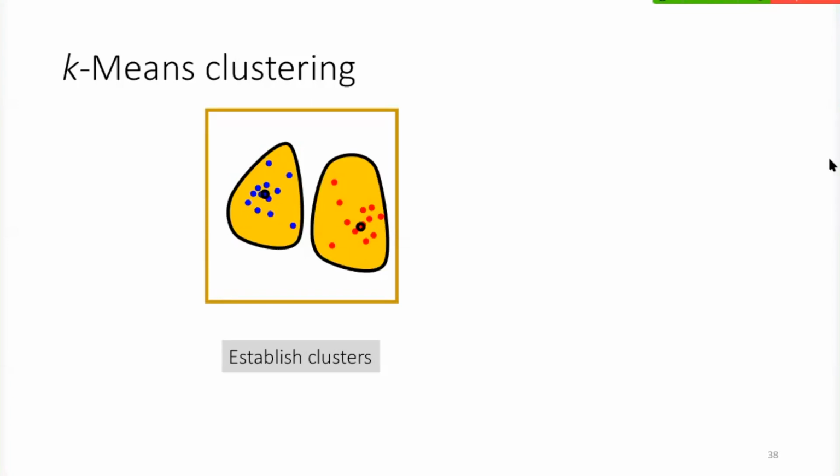Any questions? About the hierarchical clustering: here we choose the prototype, but how is it going on there? So in the dendrogram, when I said you need 2 clusters, you cut the dendrogram at the height that gives you 2 branches. If you say I want 3, then you need to go down a little bit until the tree breaks into 3, and that's the cut of your data.